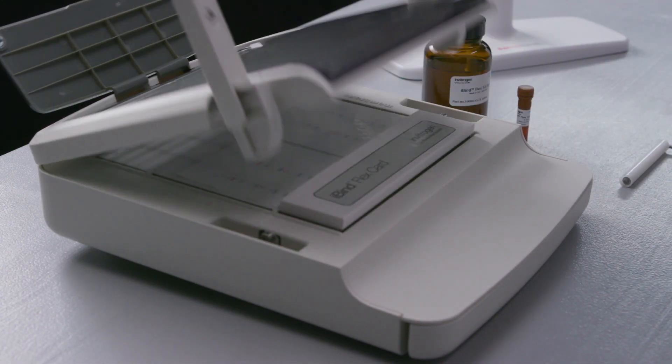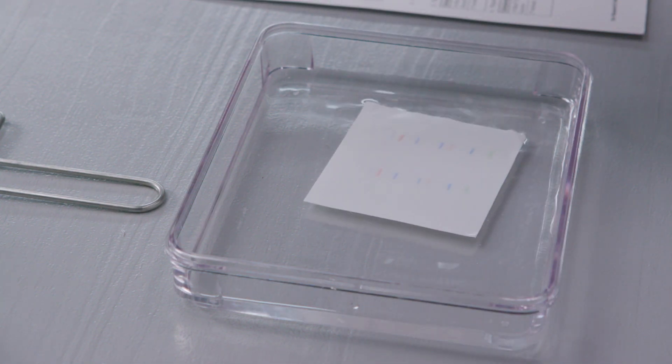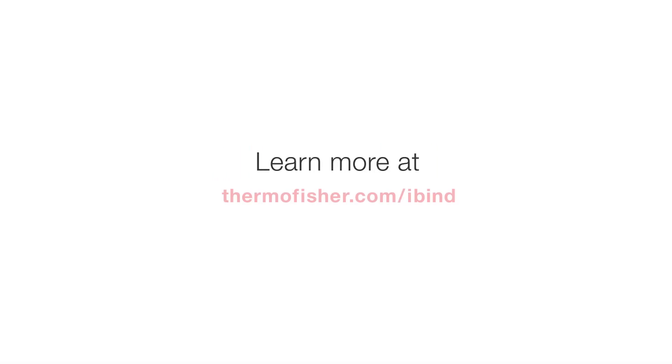Once completed, rinse your blot in water and dispose of the used iBind card. Proceed to your chemiluminescent, fluorescent, or colorimetric western detection protocol. Get more information about Invitrogen iBind Western Systems at ThermoFisher.com/iBind.